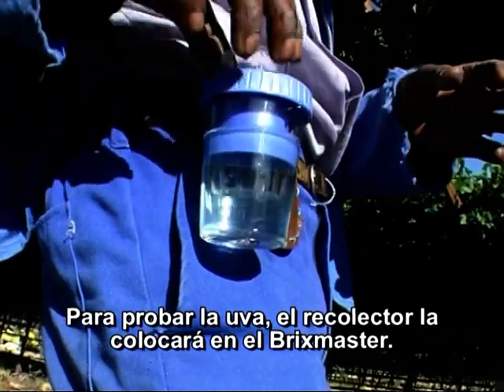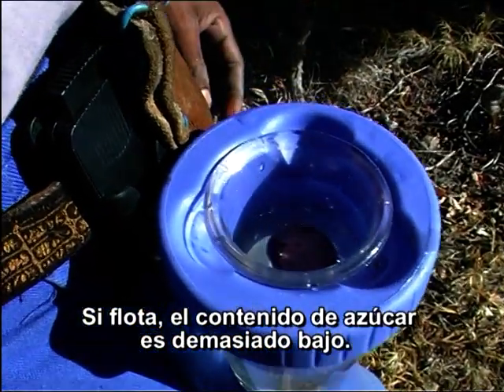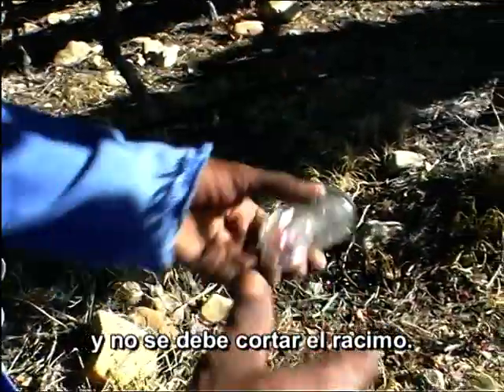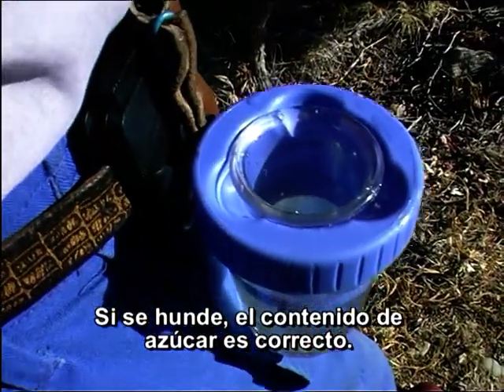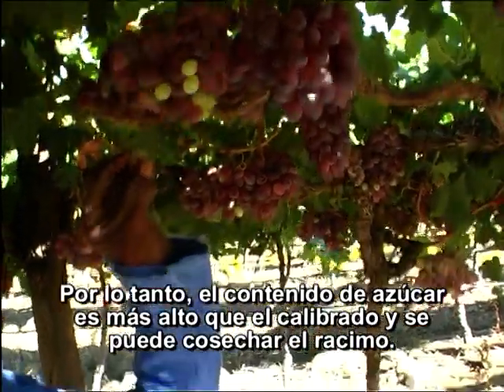To test a grape, the picker will put it into the Bricks Master. If it floats, the sugar content is too low — that is, lower than calibrated for — and the bunch must not be picked. And if it sinks, the sugar content is right. The sugar content is higher than calibrated for, and the bunch can be picked.